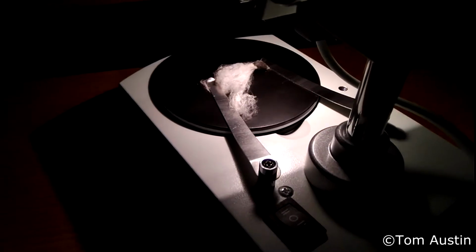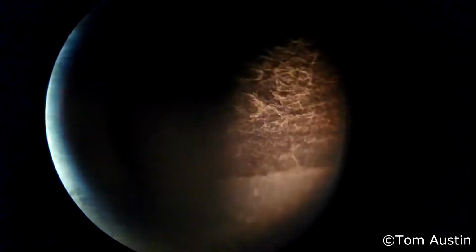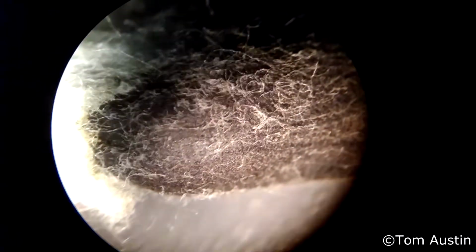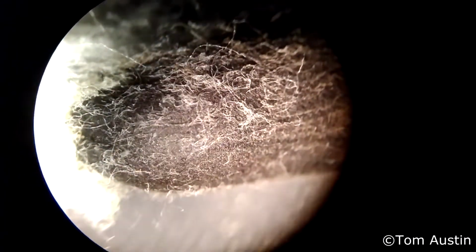Here we have that other inferior seed I was talking about, so we're going to zoom in on that and show you the differences in the fiber quality. So right off the bat, you should be able to note that the fiber appears to be a lot curlier. Just a lot more wrinkly in appearance. And that'll be more apparent the further down we get in the fiber quality.